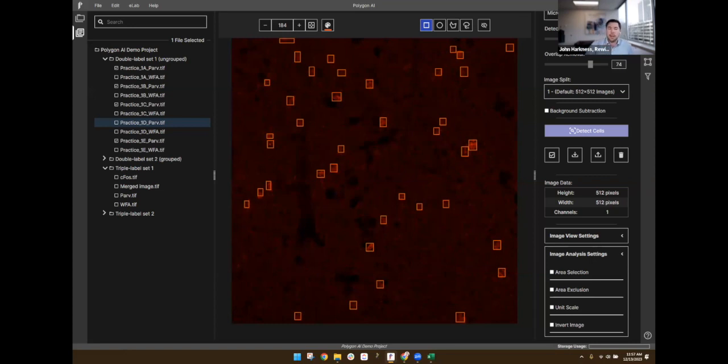Currently our free licenses are essentially able to log you into one Polygon instance at a time, but you can install Polygon on as many computers as you would like, and you can log into as many computers as you'd like. It will just only run the AI on one computer at a time, maybe a little bit like Netflix. The same goes for the premium licenses: they only run one computer at a time, but you can log into as many as you want. And we potentially have some lab licenses coming down the road with greater management capabilities.